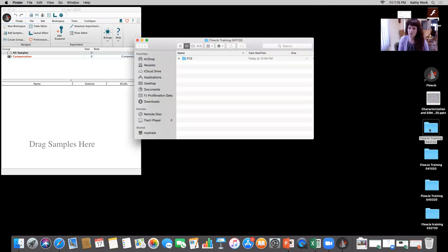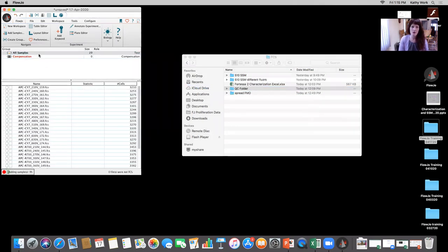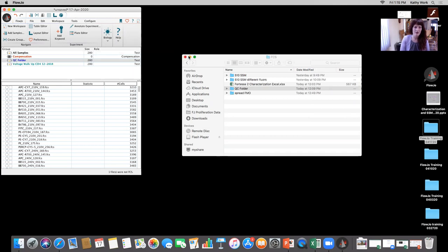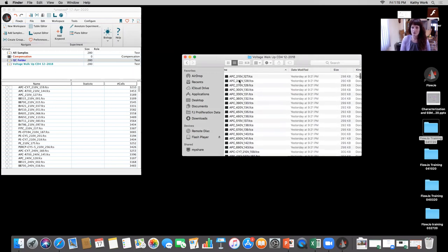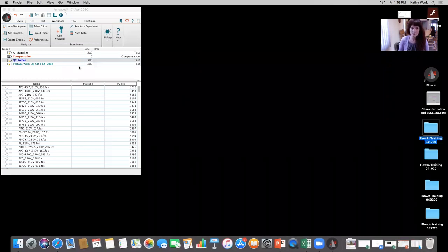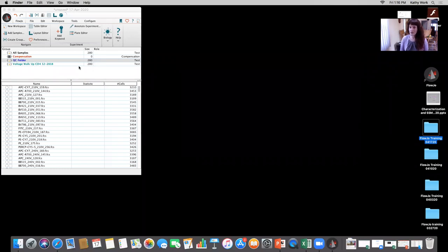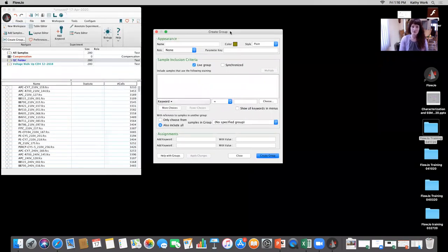In our flow cytometry core facility at MSK, we did this exact CD4 walkup I mentioned, and I'm going to take some of those data files and show you how we analyze that and calculate what we want to use as the best optimized PMT voltage. We have our training session from today. If I drag a folder to all samples, it's going to bring in all FCS files from that folder — 280 files to be specific. But I'm not going to analyze 280 FCS files today.